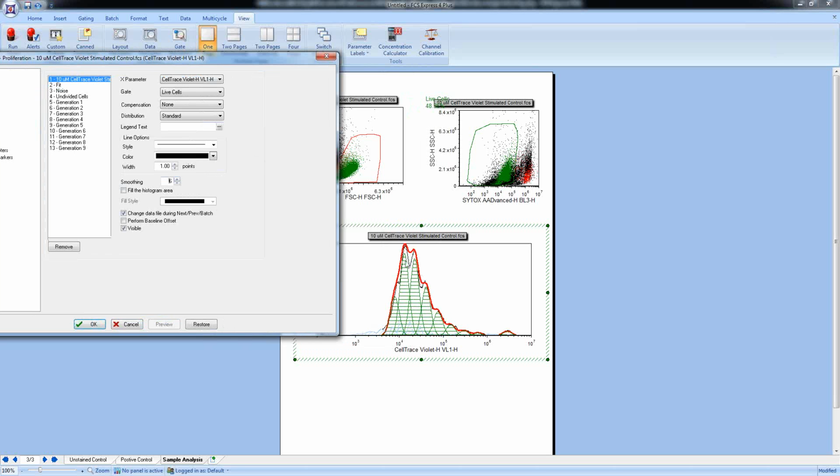You can see how everything in this model changes, right? So there are very few reasons that you should be trying to smooth this data. The only reason you would maybe want to smooth that data is if you really don't have a lot of events and you need to clean it up just a little bit. You could maybe use the smoothing set on 1 or 2.